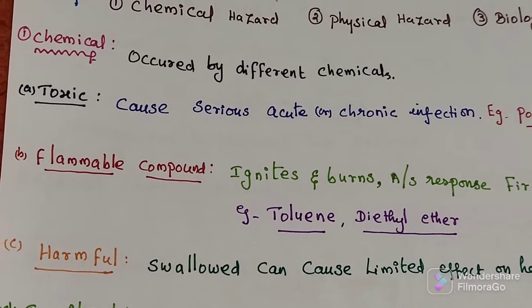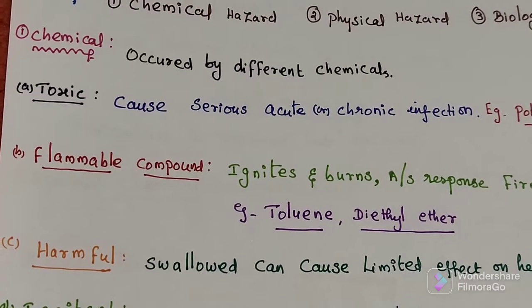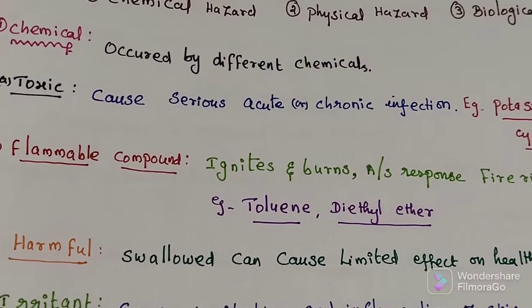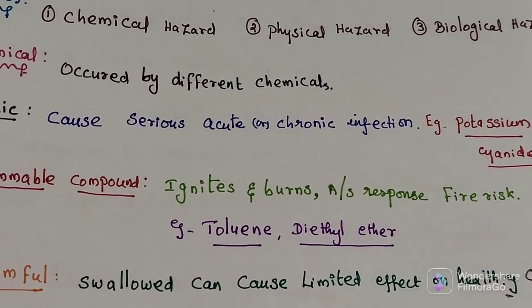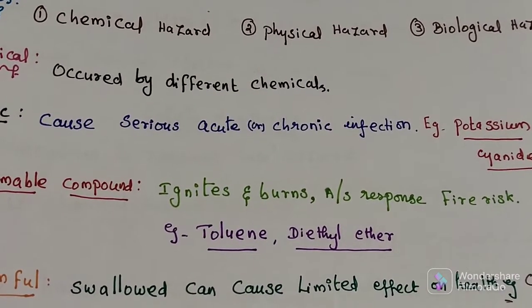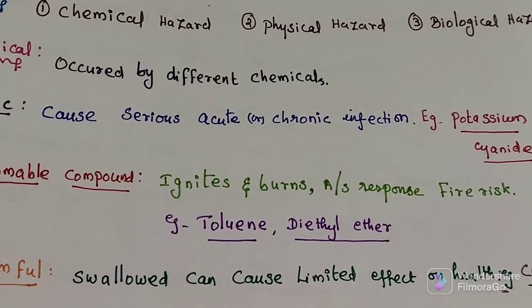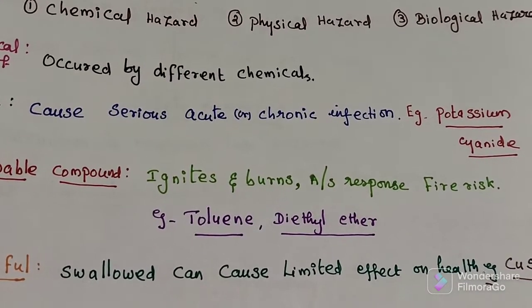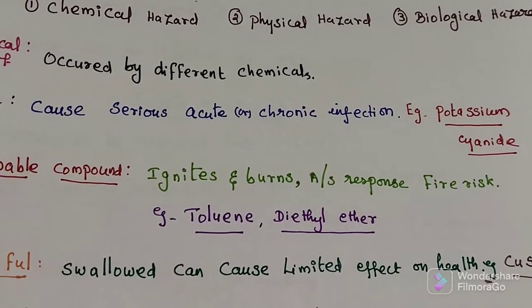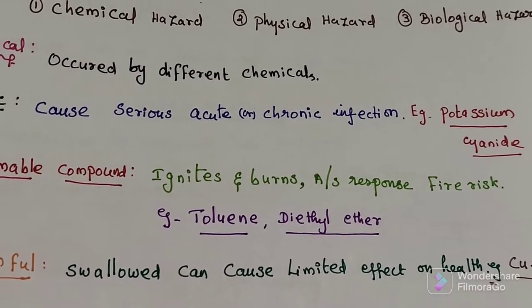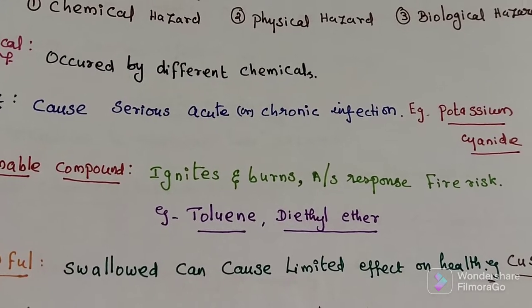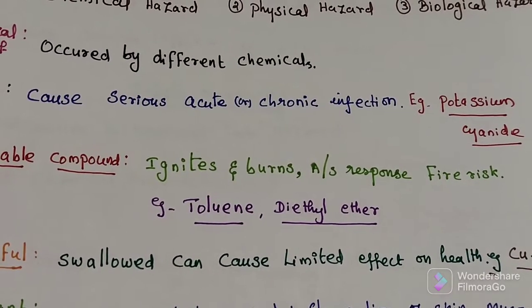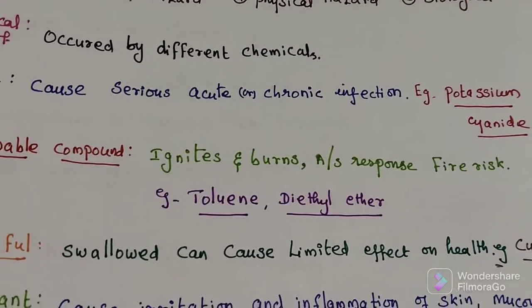The second type is flammable. A flammable chemical is one which ignites — that means it causes fire and burns. It is responsible for fire risk in the laboratory. Examples include toluene and diethyl ether.